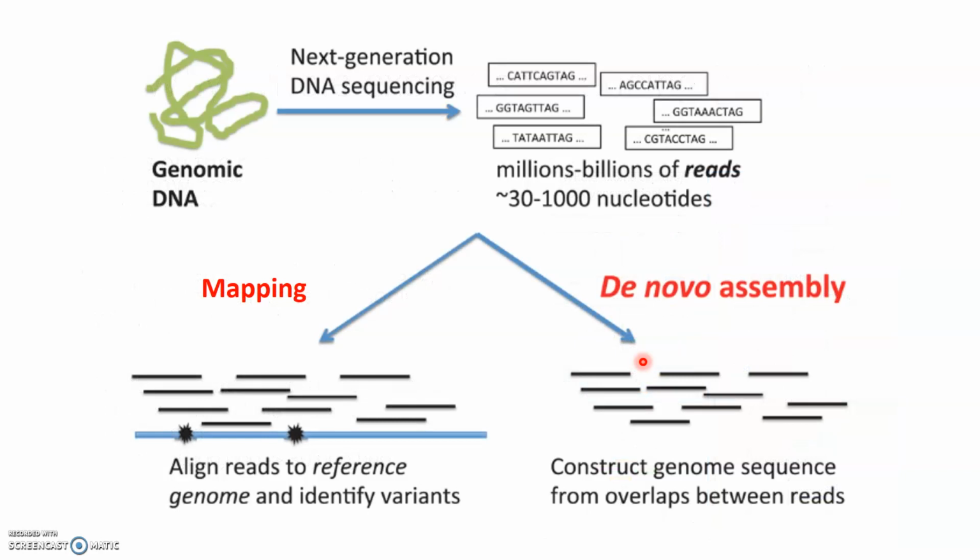And so here's just a rundown schematic of what we've previously covered. Remember, we had a question on, I believe it was Quest 2, about doing some sort of what's called de novo assembly with these short reads, right? So finding that microhomology, or that small overlap between sequences, to build that consensus.